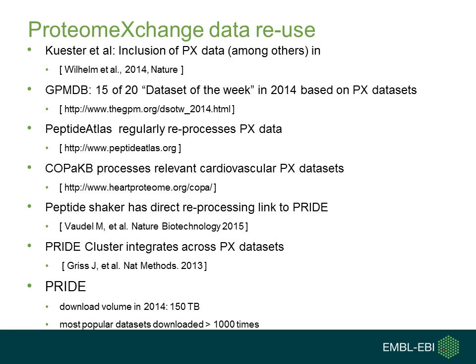Another interesting aspect is that recently there was a publication in Nature Biotechnology about a tool, PeptideShaker, which allows to directly access data in PRIDE, only in PRIDE at the moment, download this, reprocess the data with new parameters, and then in principle also directly upload the data, assuming that interesting discoveries have been made which lead to a publication.